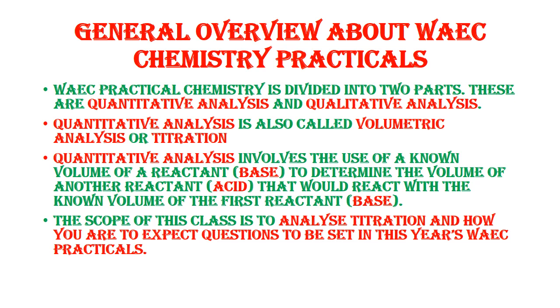Like in the one that will be coming out in this year's Waec, we have the acid-base titration, where we get a known volume of the base. The reactant whose volume is known is the base, and it's normally 25 centimeter cube.